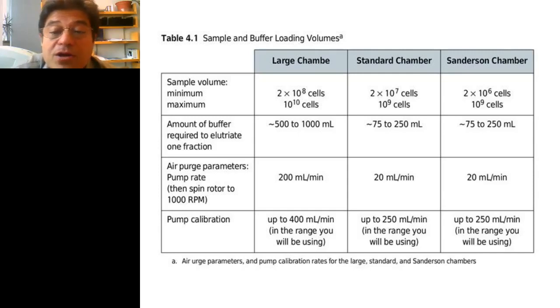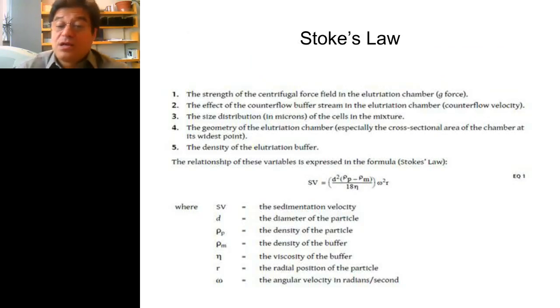It's got different parameters for operation. And this tells you a little bit about how to get the instrument set up, how to get that chamber set up, but also how much material can be loaded effectively into these chambers. Of course, all of this gets back to the physics, and the basis of elutriation is Stokes' law, which describes sedimentation velocity. Here's all the information.